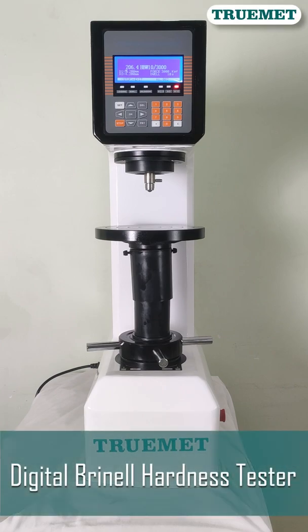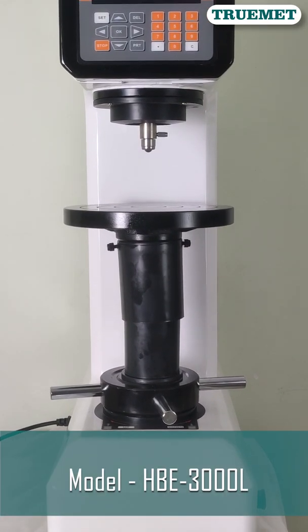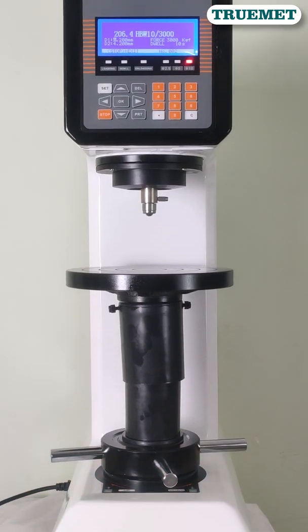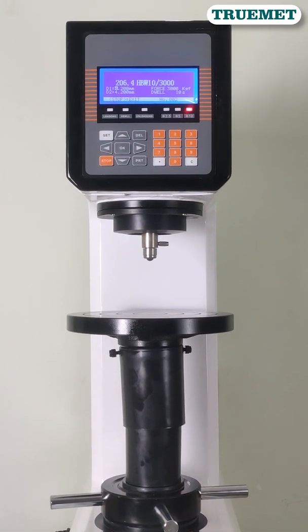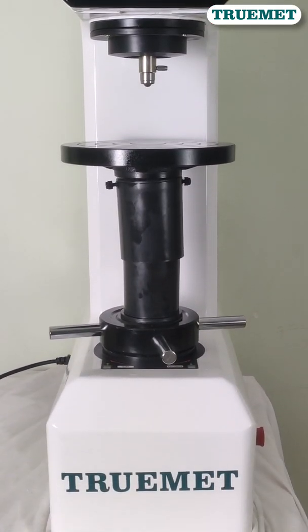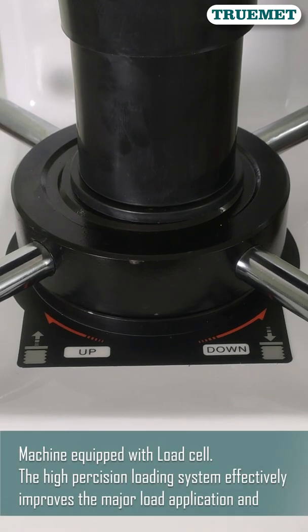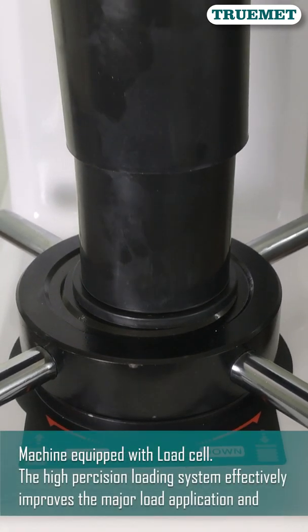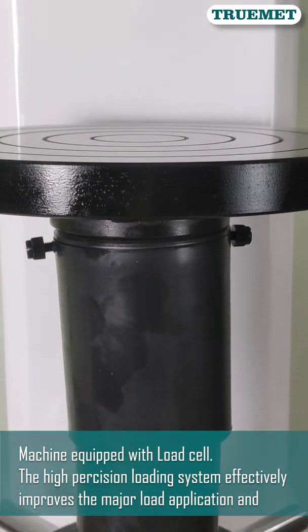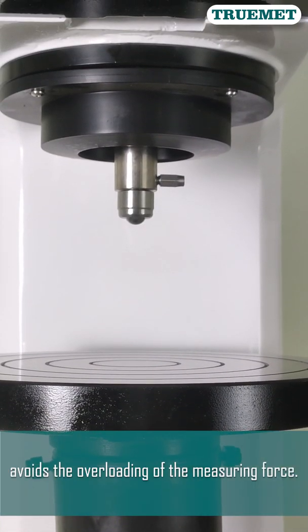Truemet presents Digital Brinell Hardness Tester, Model HBE-3000L. The machine is equipped with a load cell. The high precision loading system effectively improves the major load application and avoids the overloading of the measuring forces.